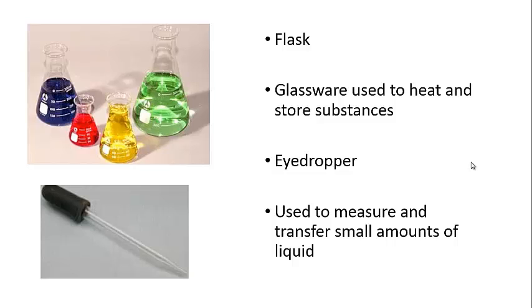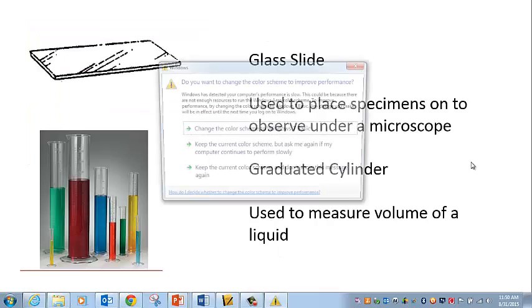We can also use an eyedropper. An eyedropper or a very small pipette is used to transfer very small amounts of liquid.